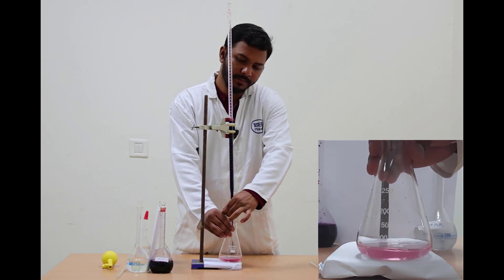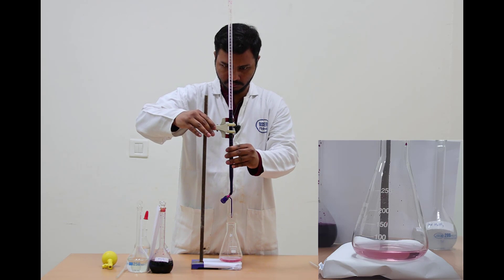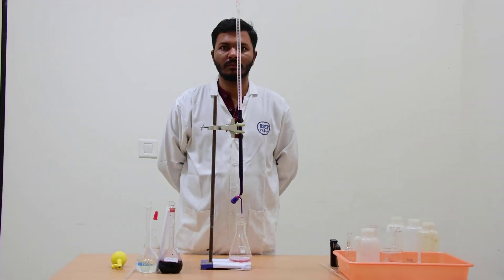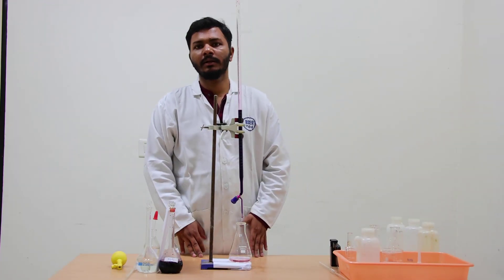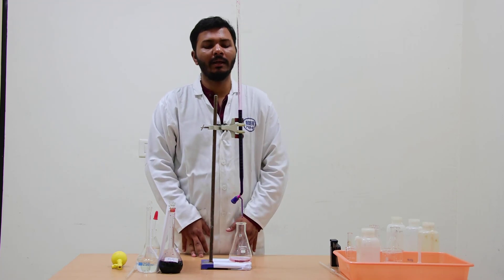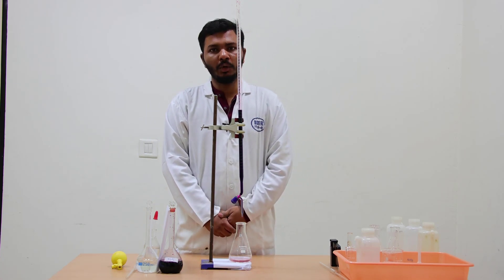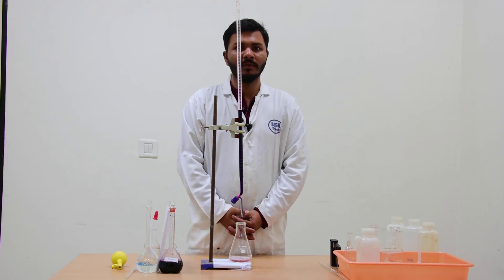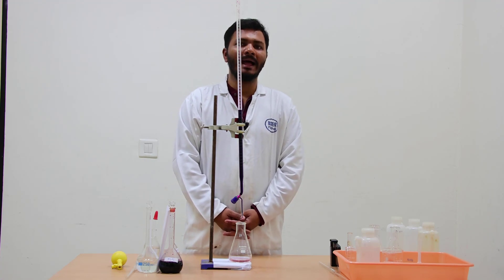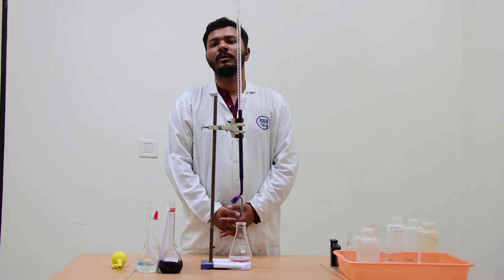We get the end point and the burette reading was 30. In the third case, we started from 19.8 as the initial reading and got near about 30 as the final reading, giving 10.2 ml. So in the first case that is 9.5, in the second case that is 10.1, and in the third case that is 10.2. We get the average value and from it we can further conclude the experiment.